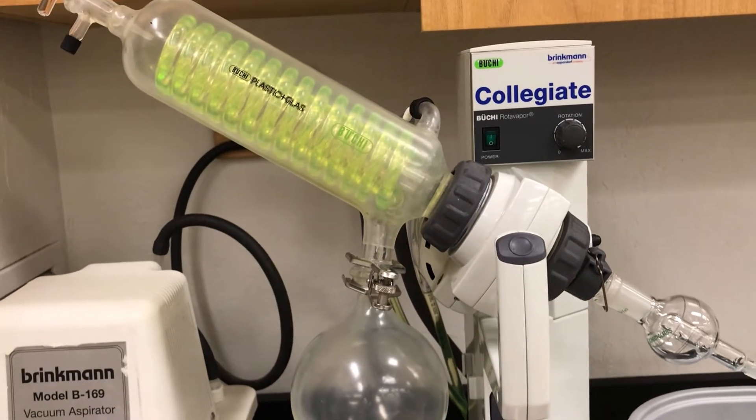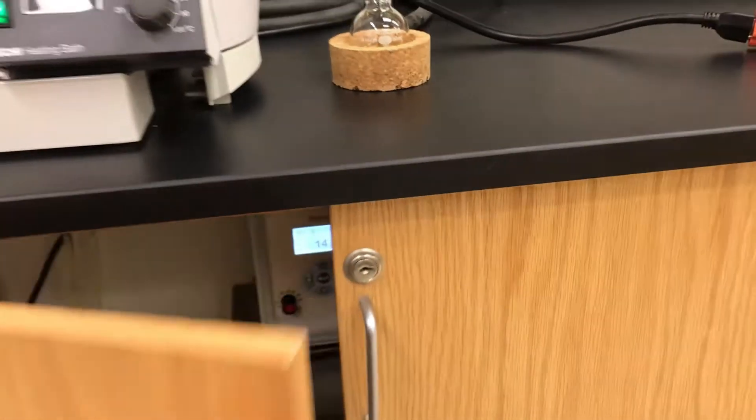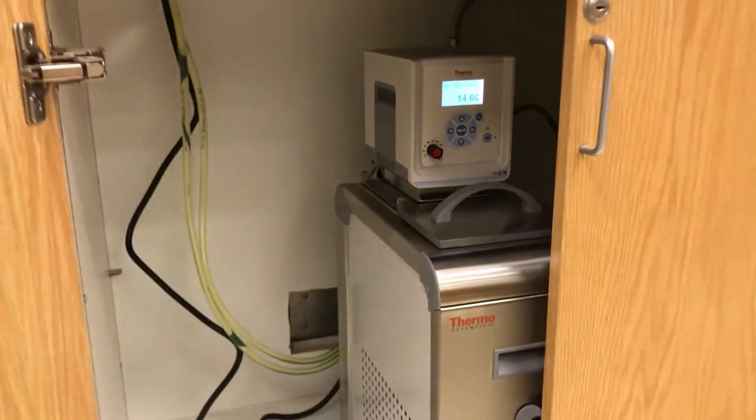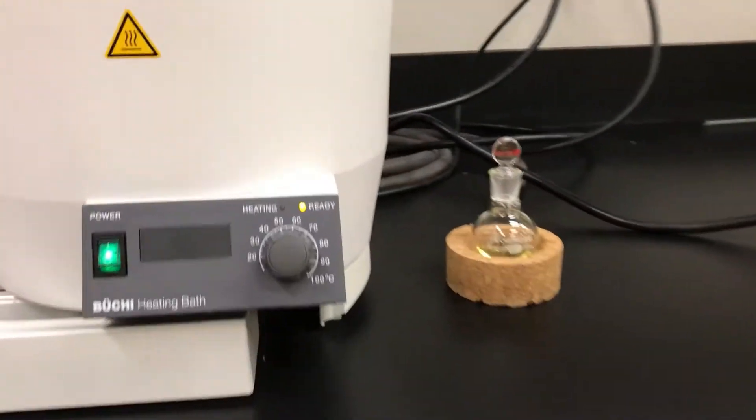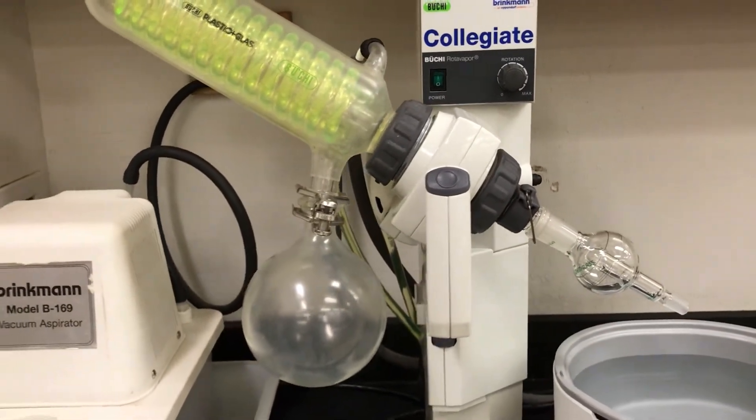That's our condenser and the yellow liquid is actually car antifreeze and it's connected to our chiller that we have underneath. So it's going to be running cold antifreeze through that condenser which means that the hot gas is going to contact it, turn into a liquid and be collected in that big bulb which is our receiving flask.